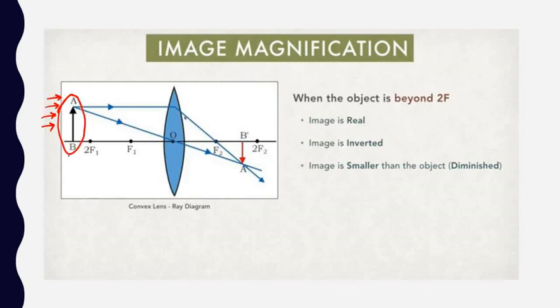So right here is your object. A and B is the specimen which you have kept on the stage. From behind this object, the light source is coming. So these blue ones are the incident rays. You might have studied this concept in ray optics: when the incident ray is parallel to the principal axis, it bends and passes through the focus, which is F2.